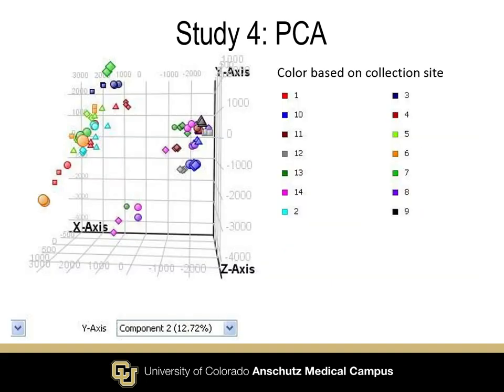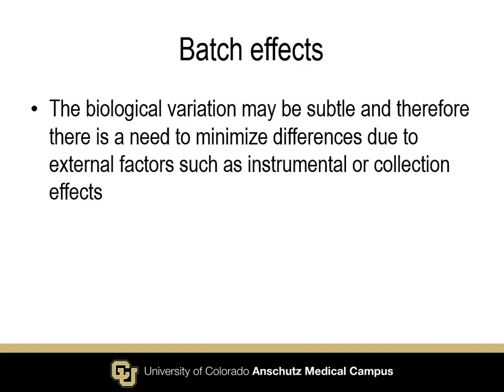So this is actually just a 3D view of it. It might even be a little bit harder to see what's going on, but there's even more separation there based on the day that they were collected and analyzed. And so this is a big issue with a lot of people doing long-term studies. The biological variation between samples can often be very subtle. And so batch effects can mask this subtlety.